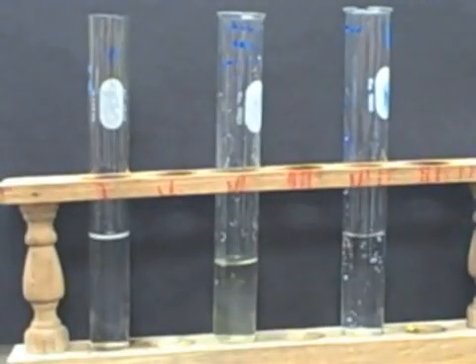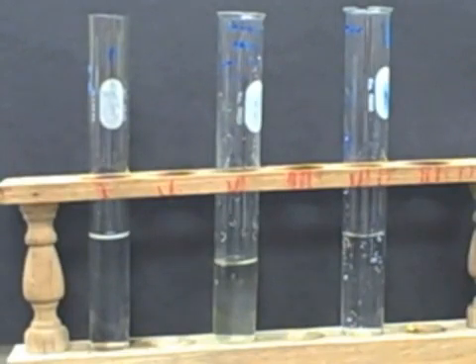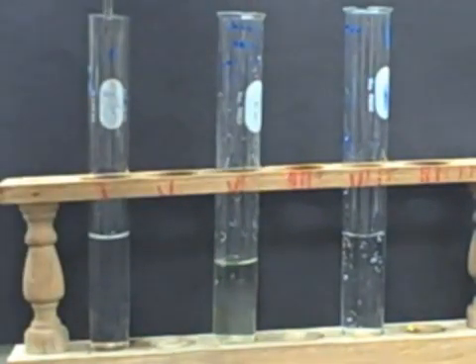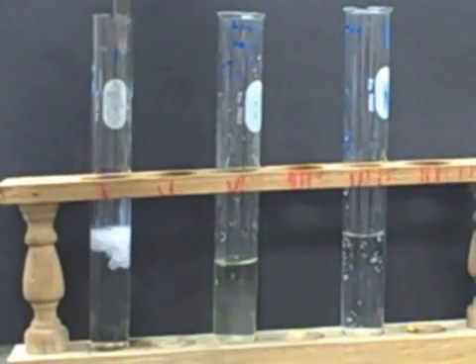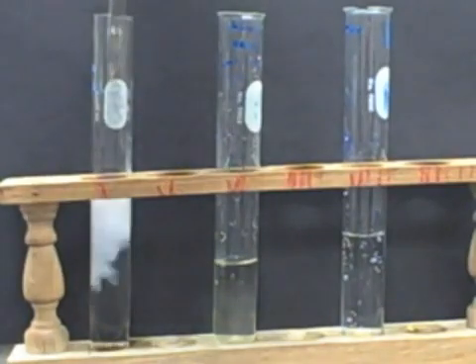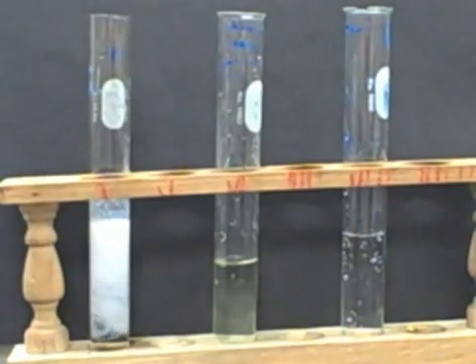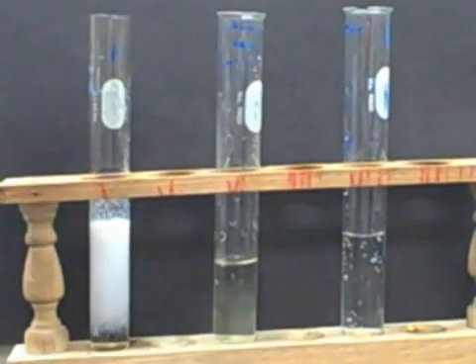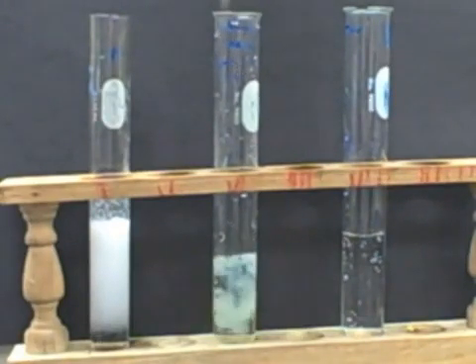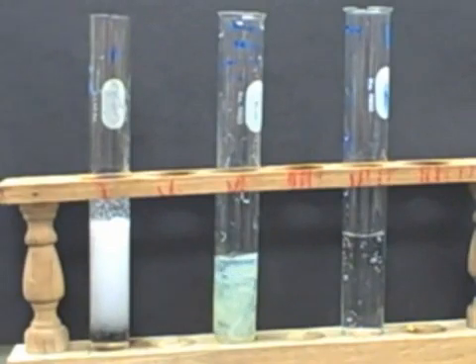So now we're doing halides, which are iodides and chlorides, or at least that's what we're doing. And so this is sodium chloride and silver nitrate added to that. You can see a nice milky white precipitate there. And then this is silver nitrate and potassium iodide, like silver iodide, which is a greenish color.